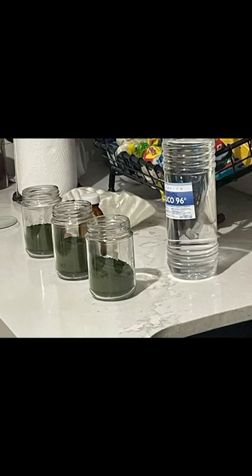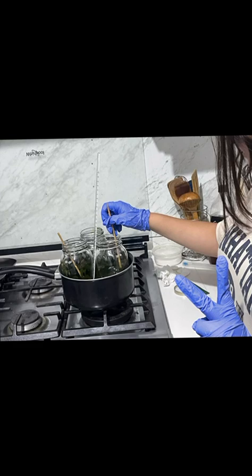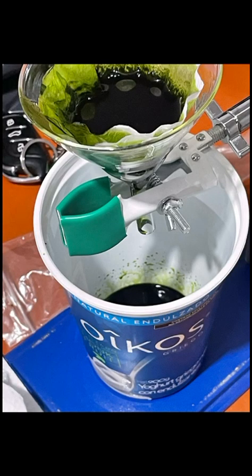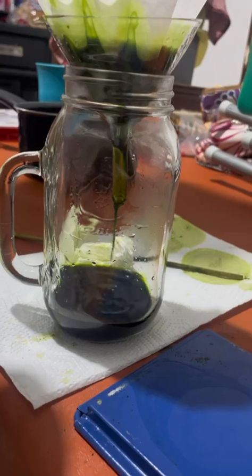Next, place the biomass in 3 glass jars with an air lid, with 300 milliliters of 96% ethanol for each one, and shake for 60 minutes at a temperature between 25 and 35 degrees Celsius. This condition allows the ethanol to dissolve the natural oils in the microalgae. After the first extraction, we let the mixture soak, filter it, and save the first extract.